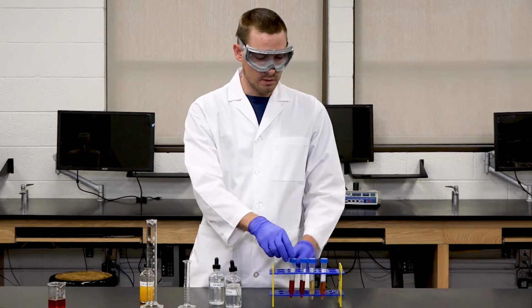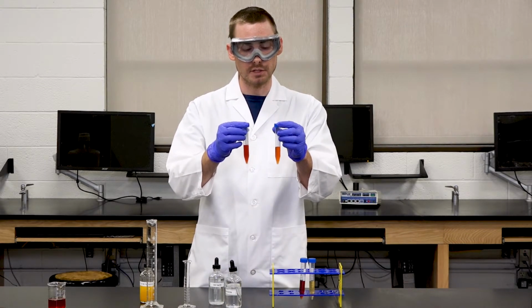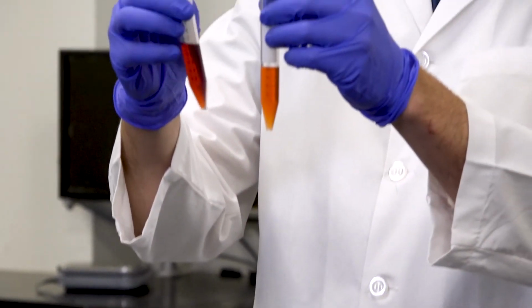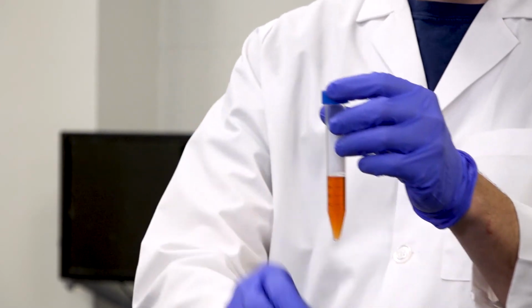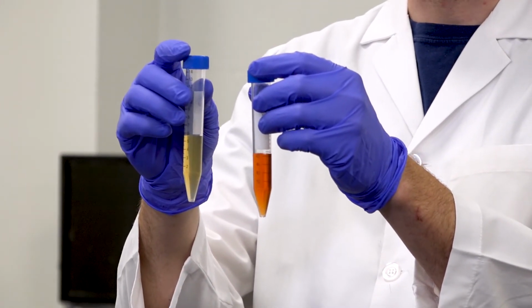As you can see, the one that we added the iron nitrate to is similar in color, but a little bit darker pink. The potassium thiocyanate one is now a deeper red color. And the test tube we added sodium hydroxide to is now yellow.